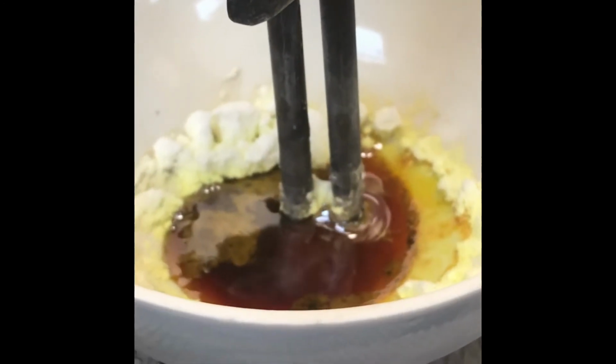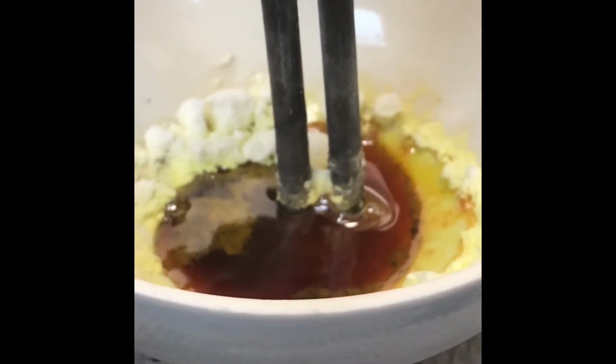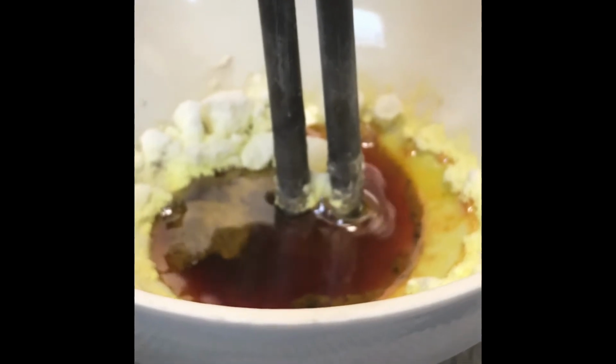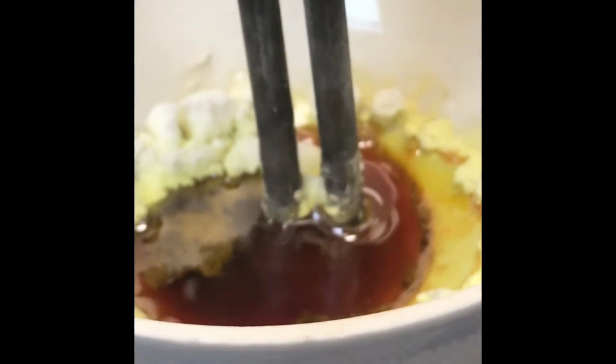After about 5 minutes heating, we can see we've provided enough energy to break the strong electrostatic forces between the ions in lead bromide. The bulb in the circuit is now lit because the circuit is now complete. The ions are able to move.